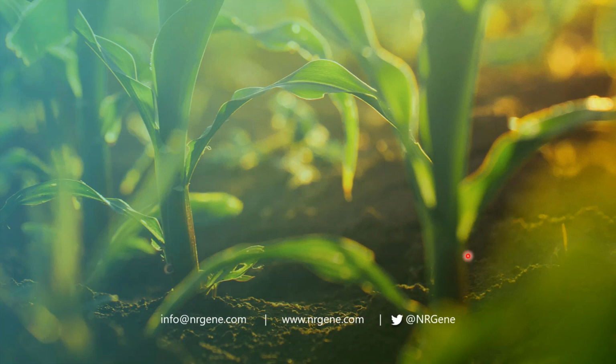Okay, I think it will be our last question as the time goes by. So the last will be, can the snipper be used in background selection? How many SNPs can be used in case of rice background selection? Yeah, so for background selection, you don't need a whole lot of SNPs. But as I showed, a snipper can be applied to get to any density that you're after.